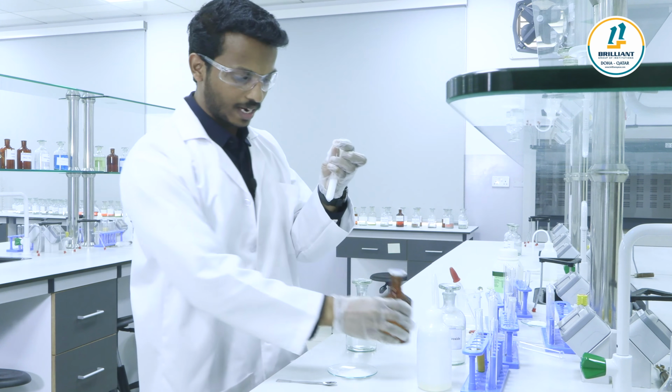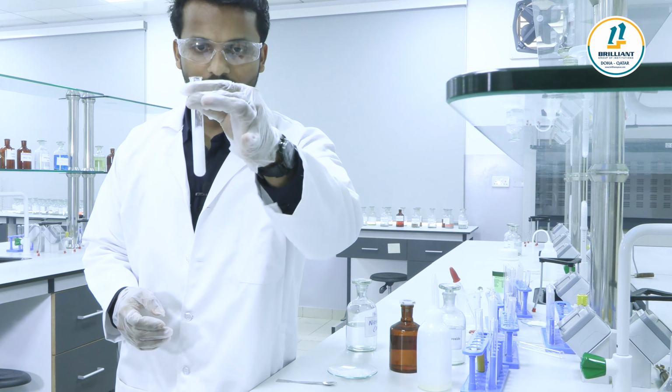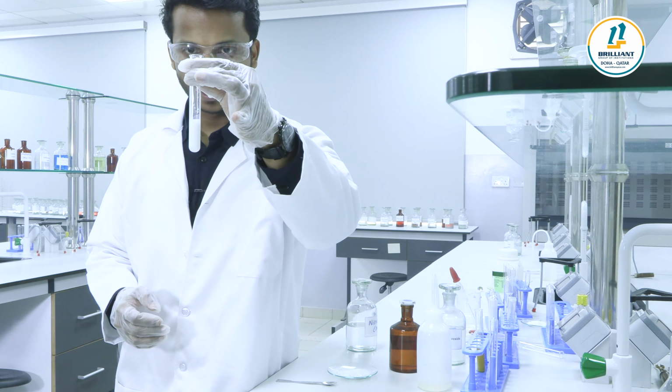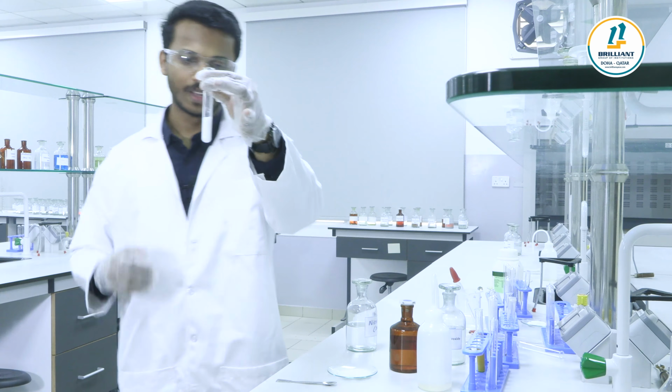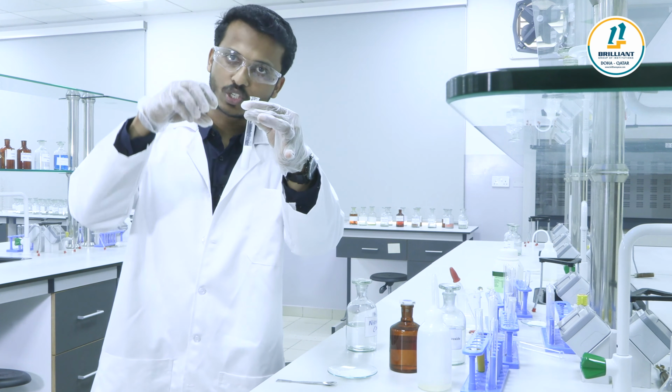We are able to see that a white curdy precipitate is forming. Okay, a white curdy precipitate is forming. You can see that. Now, this white curdy precipitate is soluble in ammonium hydroxide solution.